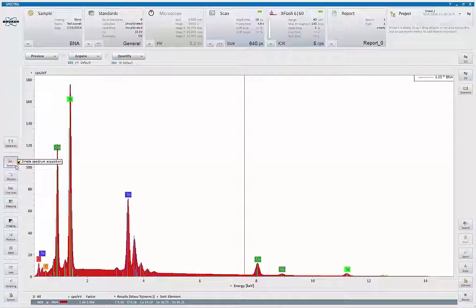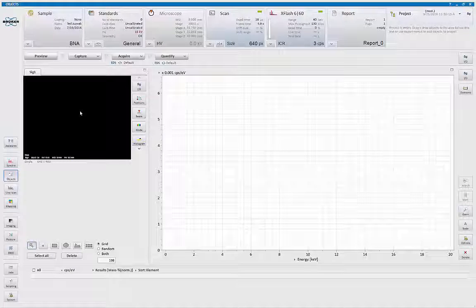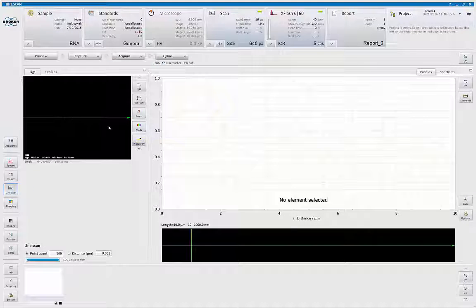Our most basic controls are spectral collection, object mode, which allows us to collect images and spectrum, annotate the image so that we can collect spectrum at various locations about it. Very nice tool to check for homogeneity, document differences within the sample, or just general quantitative analysis. Digital line scans for recording chemical compositional changes along an area.